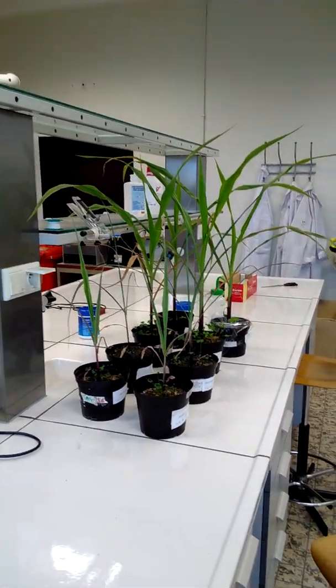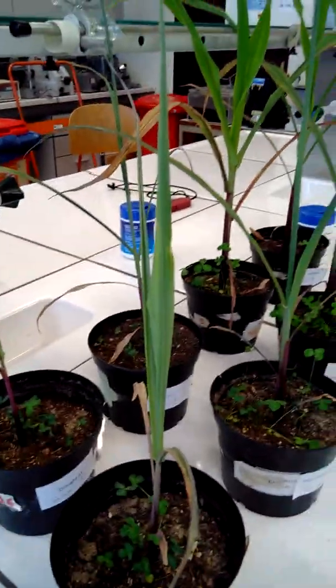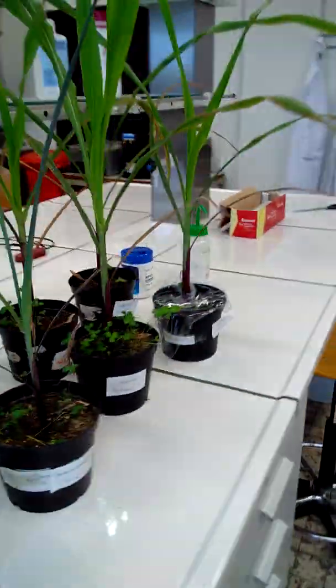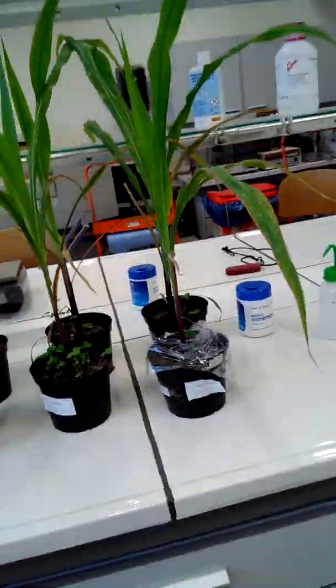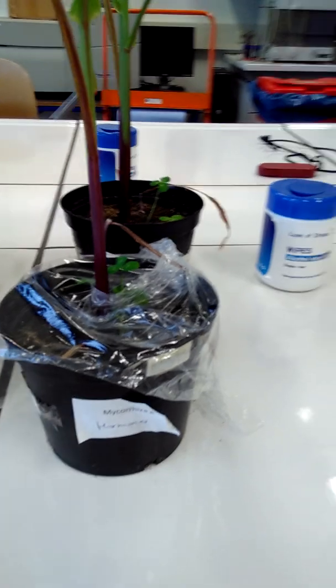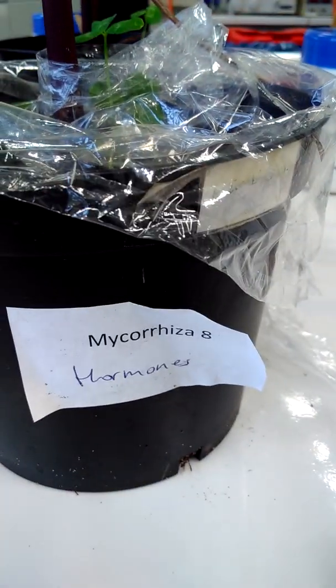What you should do, or should have done, in the practical for those measurements is label the leaves, because otherwise the data will really get messed up. What the groups usually did was label the leaves starting from the lower side: A, B, C, D, E, and so on. And the individual plants also have names: either mycorrhiza, control, mycorrhiza in drought, or drought without mycorrhiza.